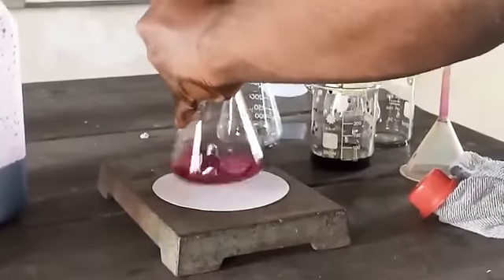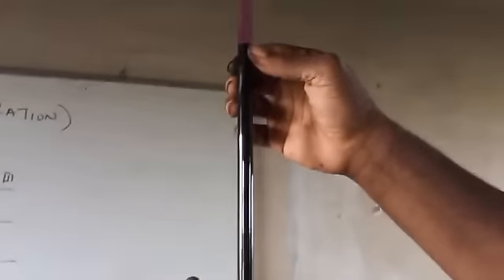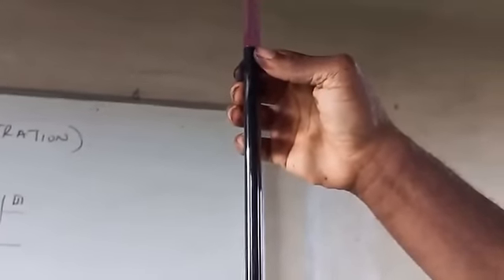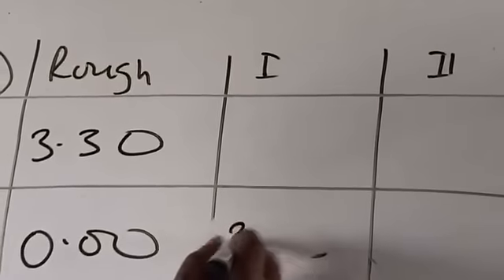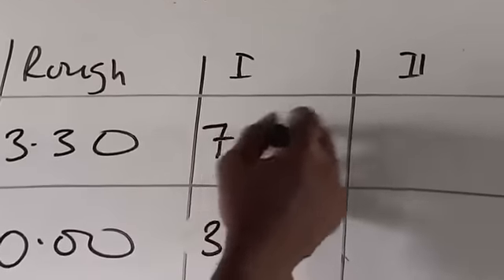That's okay. That change. We'll have about 7 here. So about 7, 6.57 is okay. So the initial reading here is 3.40 where we started from, and the color change around 7.00.